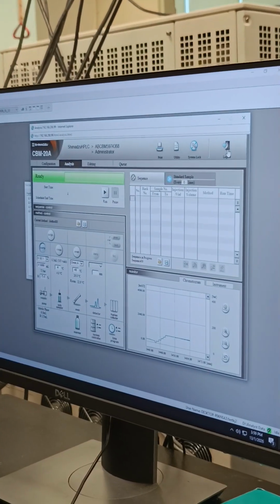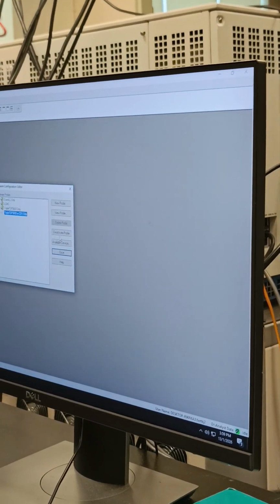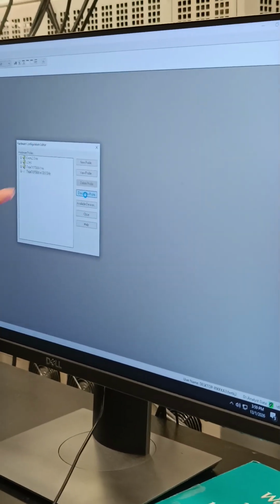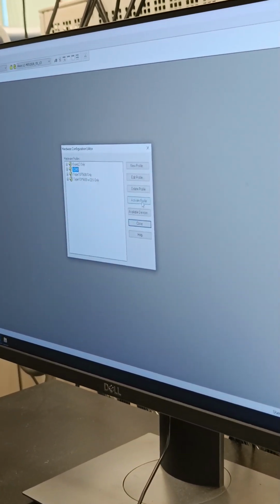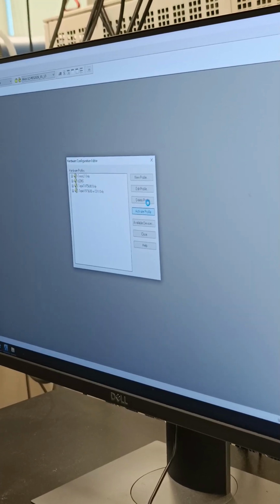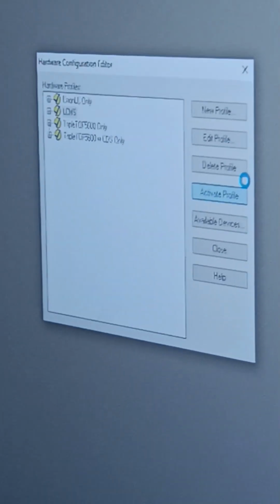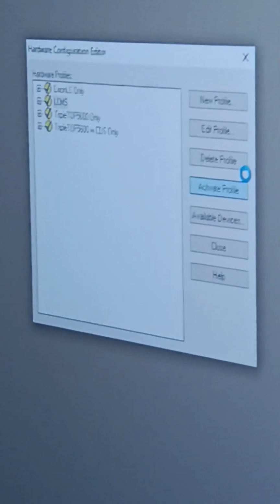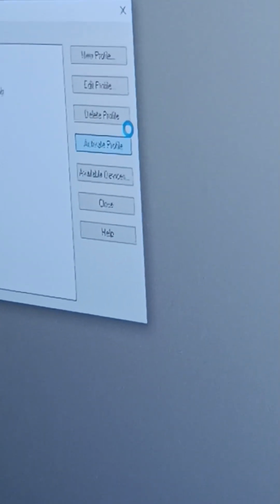Okay, so just log out from here. I can show you, I deactivate first. If now I want to activate the profile LCMS together, you will see this alarm prompt to us. It shouldn't be activated.